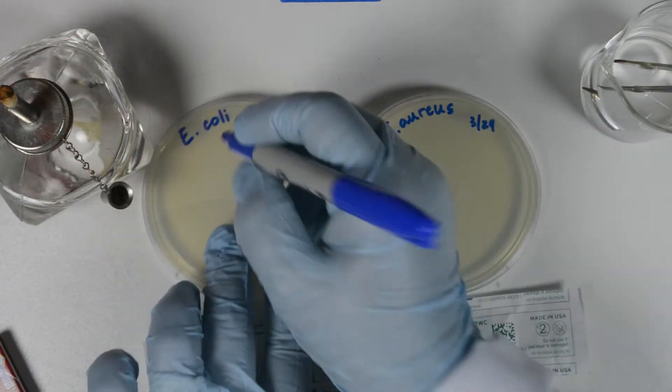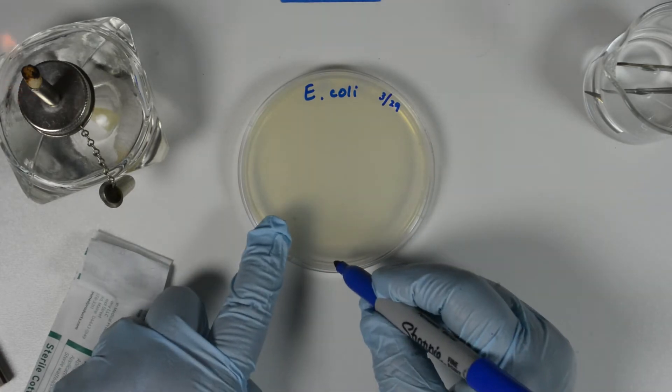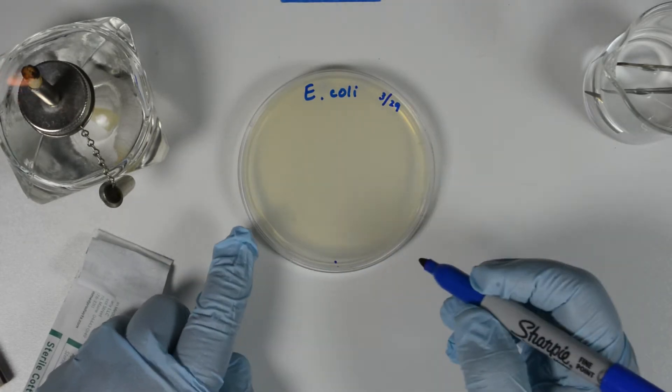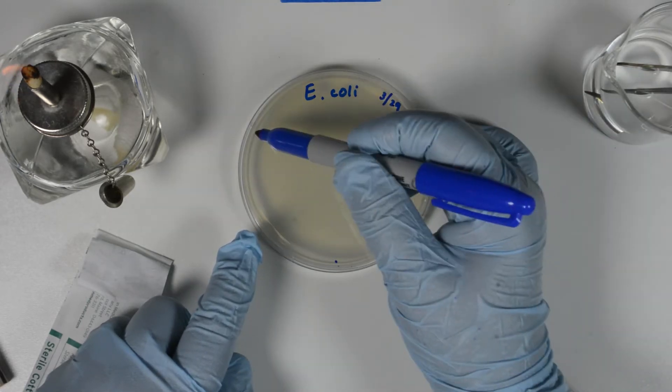The culture should be actively growing. Before you start, label the plates and make three marks on the plate at 6, 2, and 10 o'clock to allow you to rotate the plate and cover it evenly.